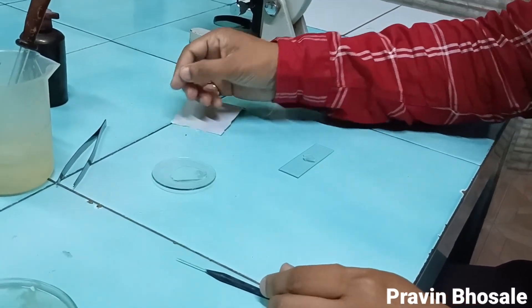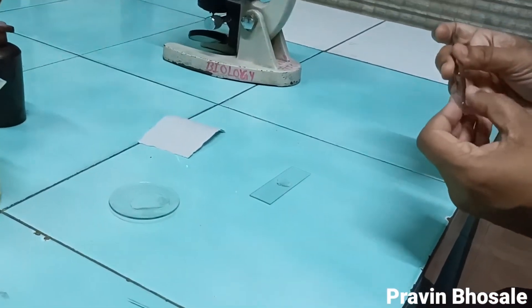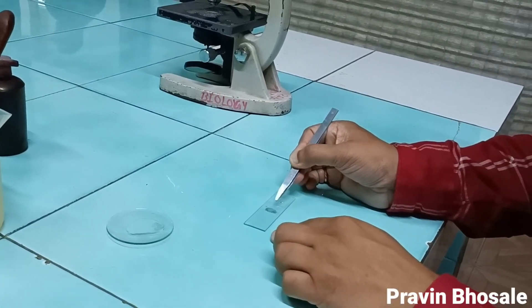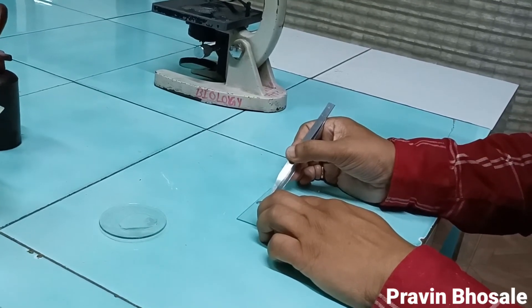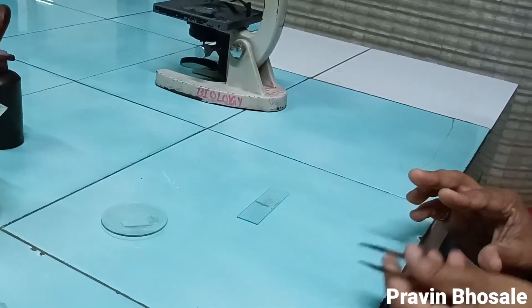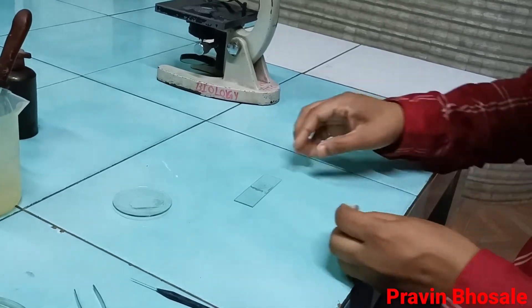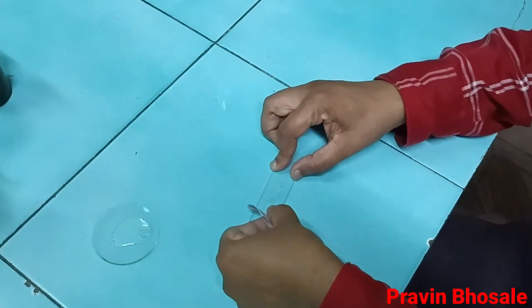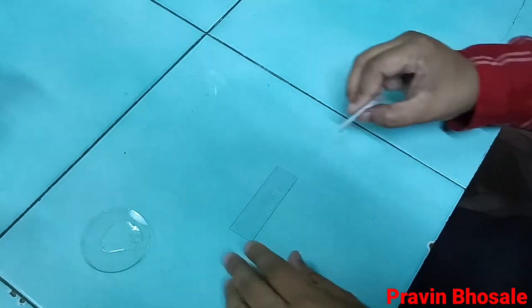Now place the coverslip. Hold the coverslip with the help of forcep and one side of the coverslip should touch the slide. Slowly remove the forcep. If there are any air bubbles, repeat this procedure again. When you place the coverslip, excess hypertonic solution comes out, which you can remove with the help of blotting paper.